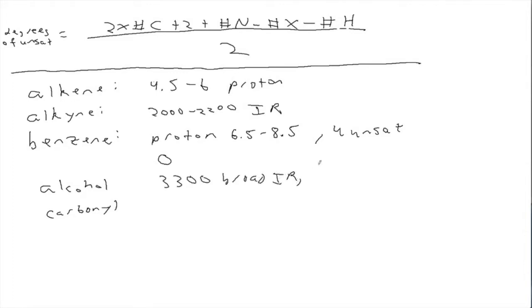Now, what do you know about how alcohols appear in Proton NMR? They're shifted off to the side at a broad peak as well, aren't they? And they come as singlets. Yeah, and there's no splitting from the hydrogen. That's important. They're singlets. That's right. And what would their integration be? 1, right? Unless there's more than one alcohol, yes. So that might seem obvious, but that's a very useful way to identify it, right? Because that's usually only one hydrogen.